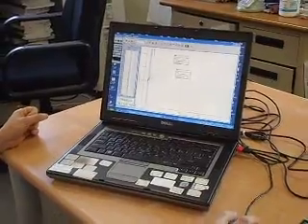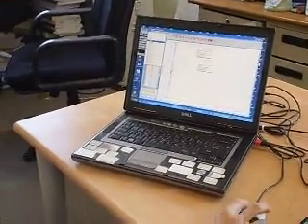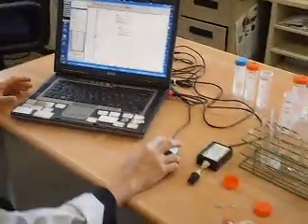Then after that, I've saved my data, so I go into the file and save it under a file name. That's the end of this video.